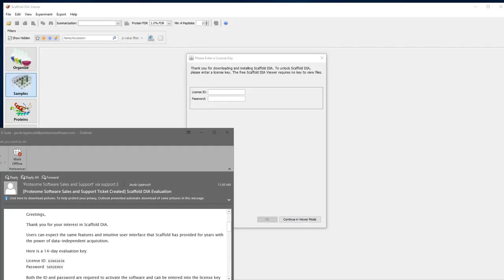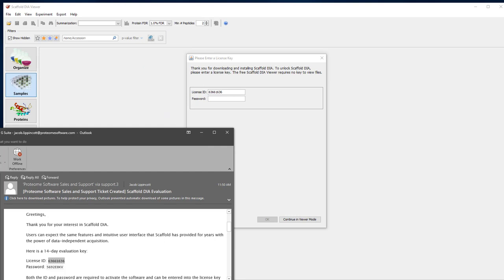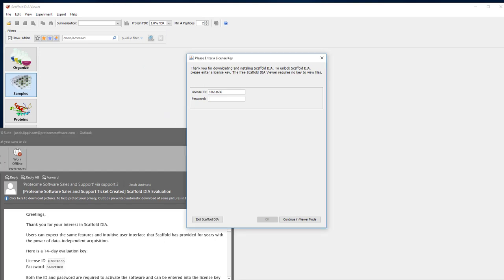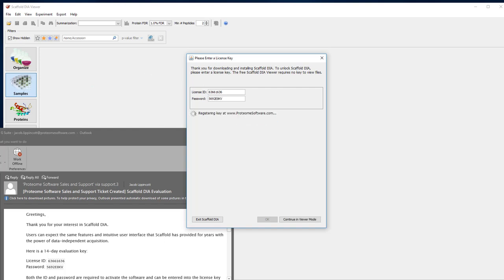Proteome Software transitioned to a new key system for managing license keys for Scaffold DIA. The email you received from Proteome Software when you requested an evaluation should contain both a license ID and an activation password. Copy and paste these into their respective fields.